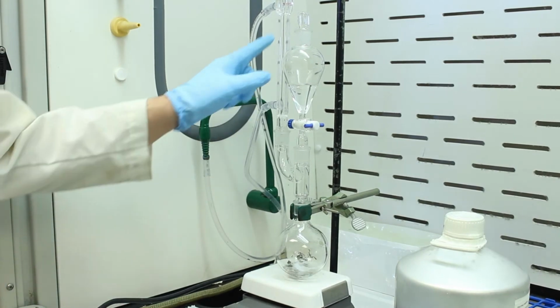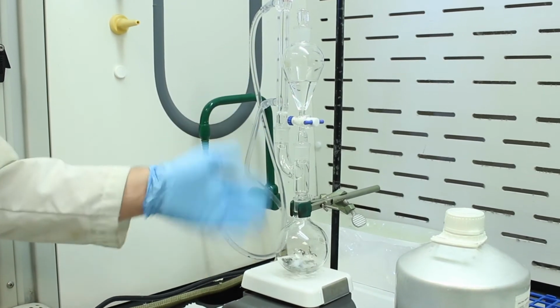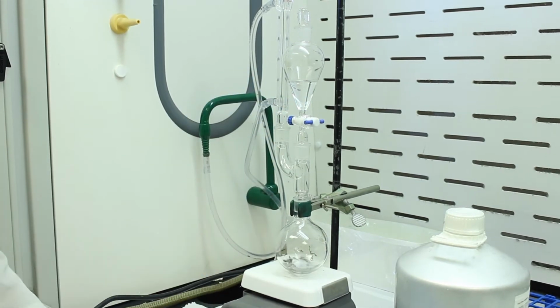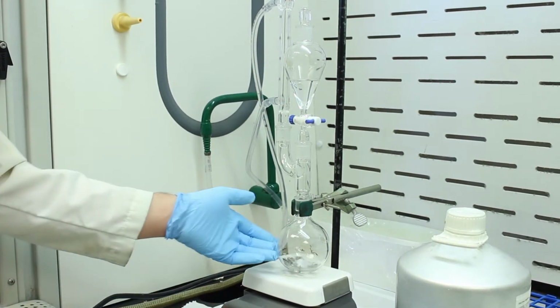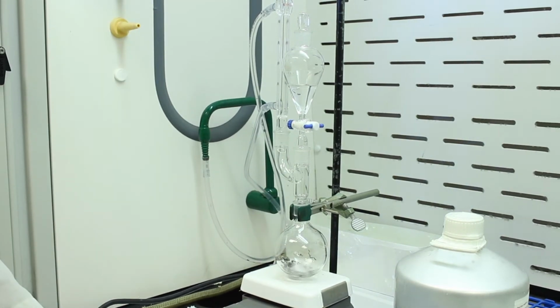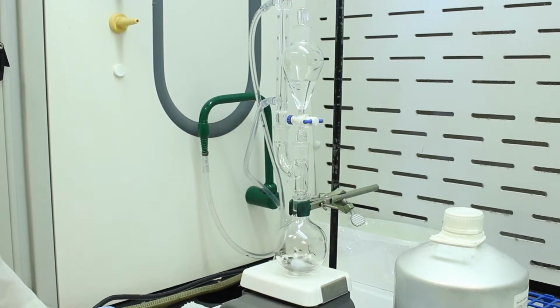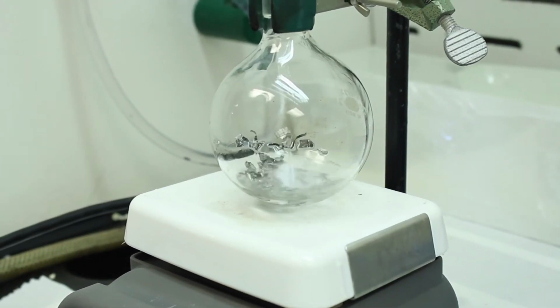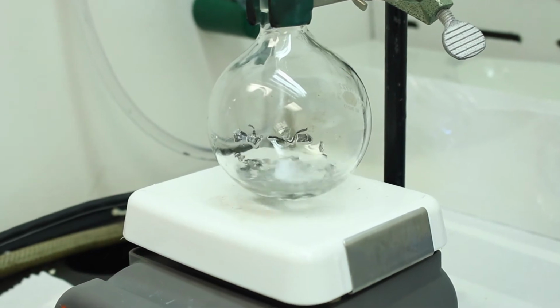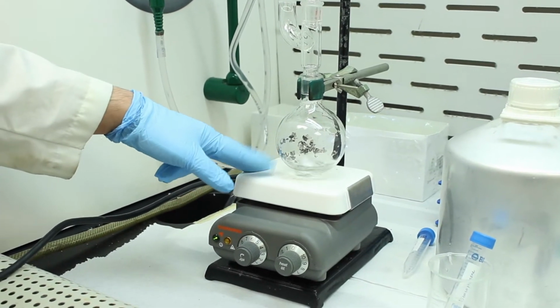And then once it starts, the goal is to sustain the reaction by adding bromobenzene periodically. We don't add it all at once just in case there's a runaway reaction and it generates too much heat and it all boils out. Okay, so hopefully this starts. We've waited a few minutes. It looks like our Grignard is not going as planned.